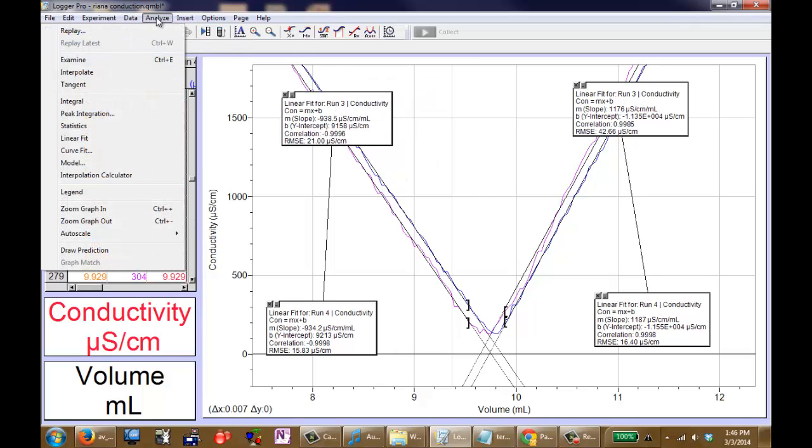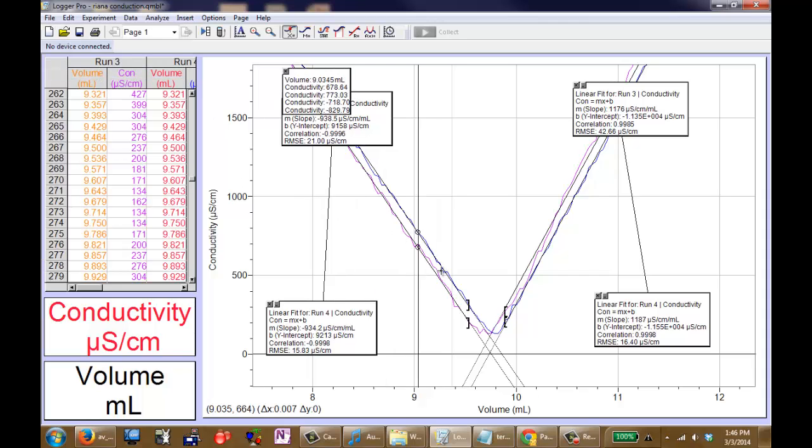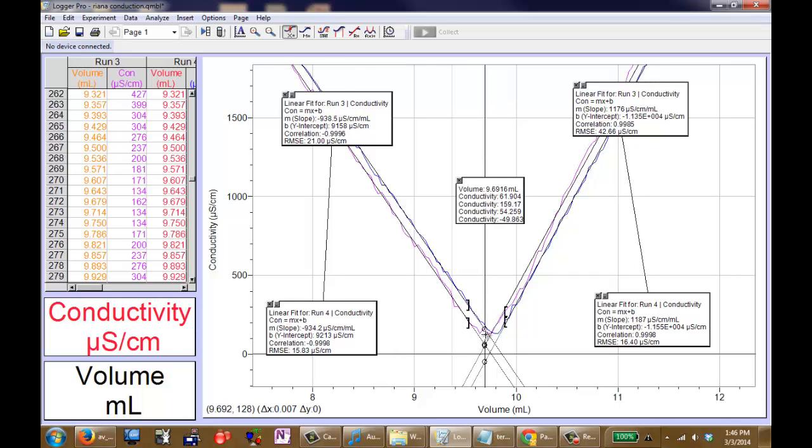We'll use the analyze interpolate feature on Logger Pro. We can see that the first point of equivalence is right here at 9.6916 or 9.692 milliliters.